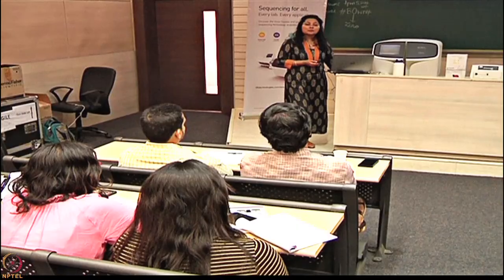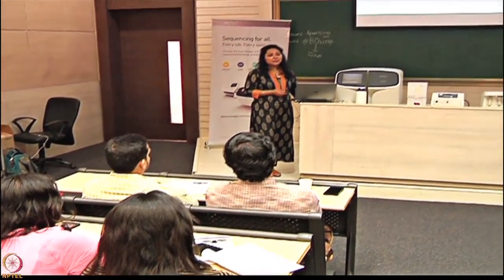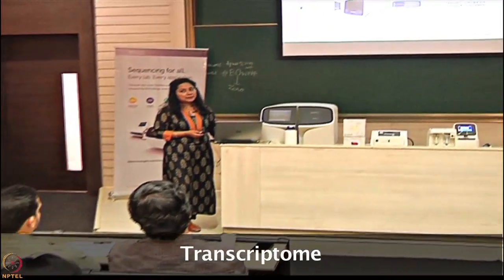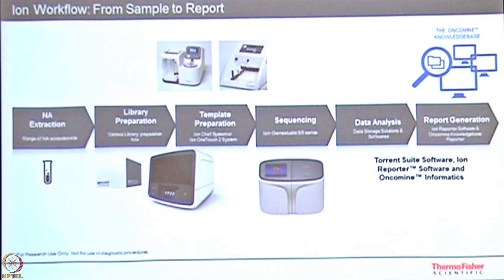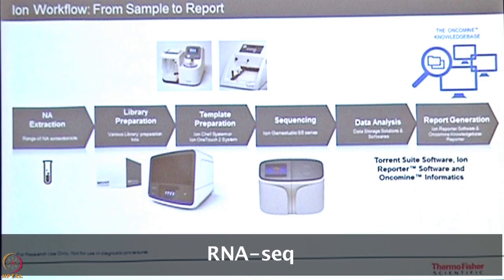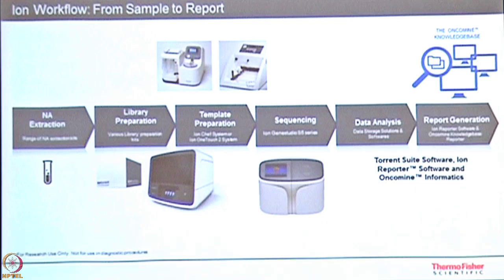Yeah. So where do you think you would be using RNA as your starting material? Transcriptomes, yeah. Again, you're looking at some targeted transcripts, or you're looking at some targeted fusion events. Anything else? RNA-seq. Yeah, RNA-seq. And RNA-seq, typically why would you do an RNA-seq?